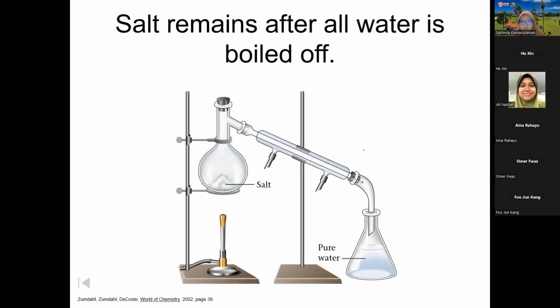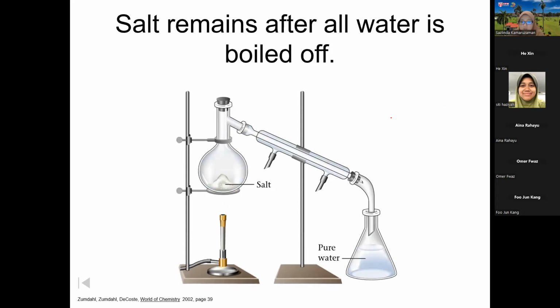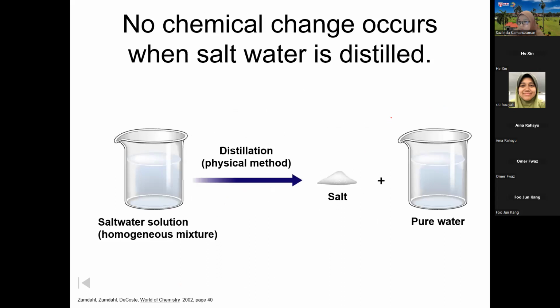Okay, so this is the one when you go through it in detail. But the most important thing is the setup of this distillation here. This one we call a simple distillation, right? The one that we always do in the lab. So this is simple distillation, because after this, I will introduce a little bit what simple distillation is as compared to the others.